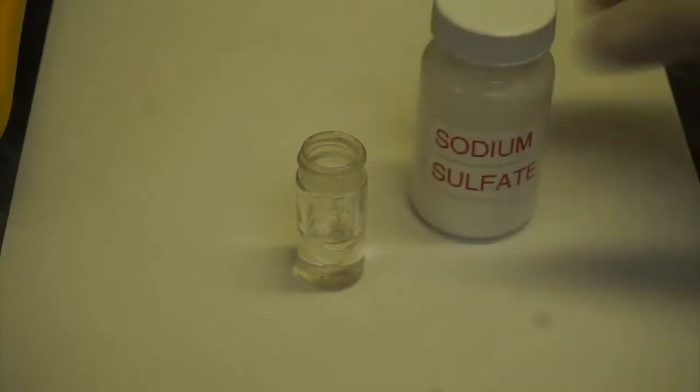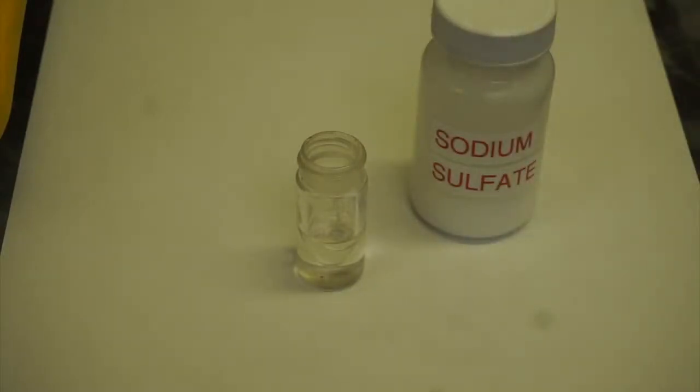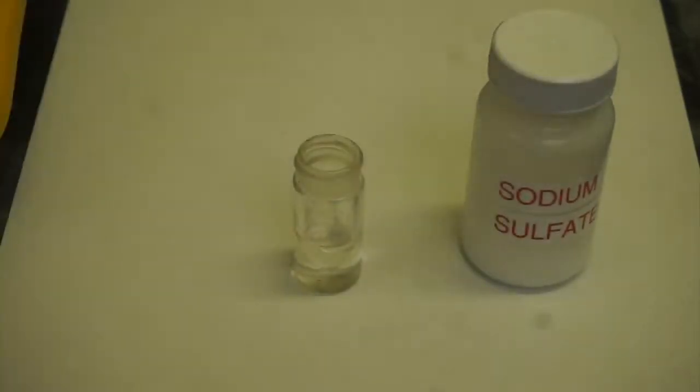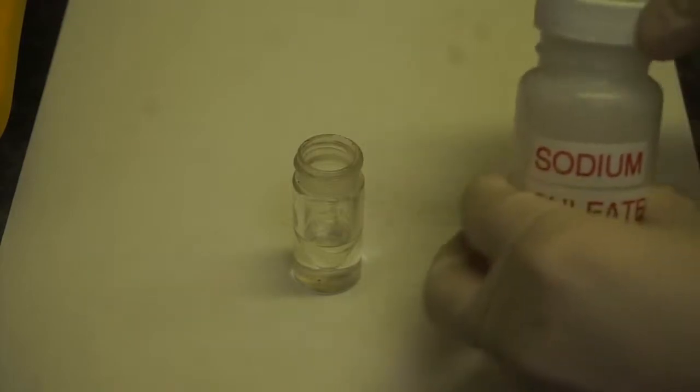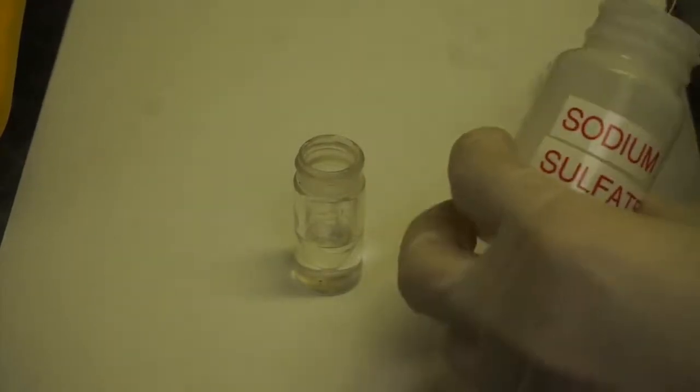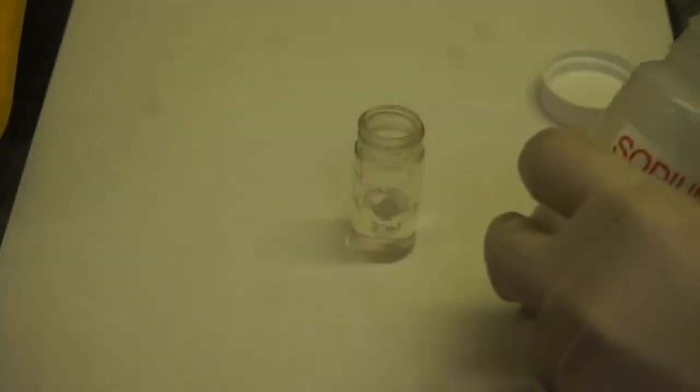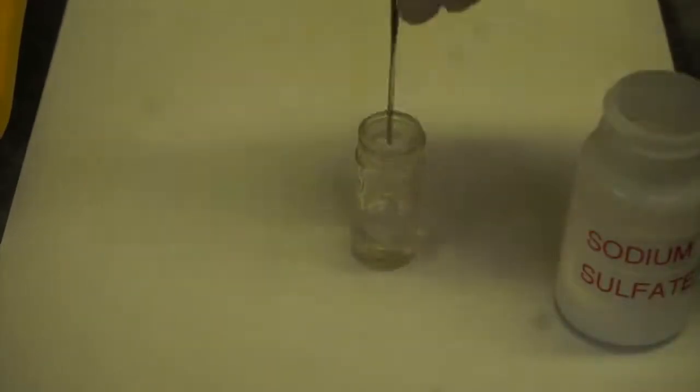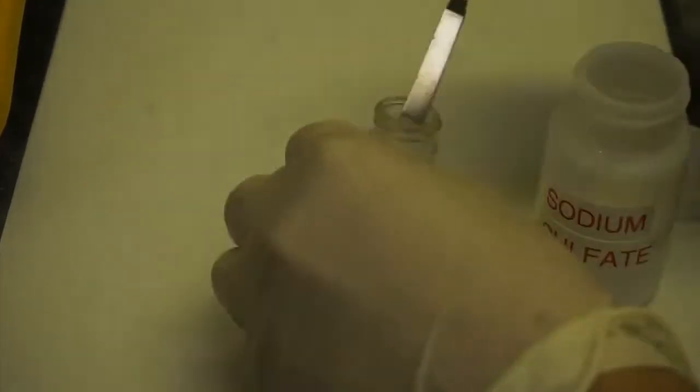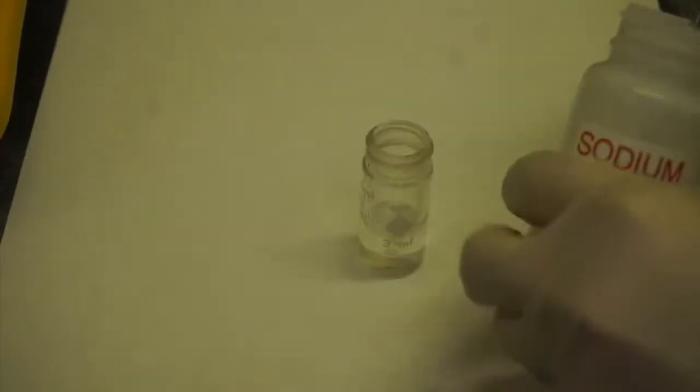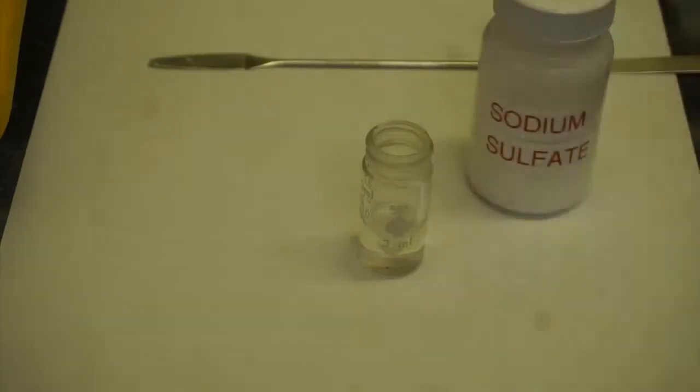First, water can be removed by addition of anhydrous sodium sulfate. So place enough anhydrous sodium sulfate into the conical vial. If you are not sure how much anhydrous sodium sulfate has to be added, please review the extraction experiment. After addition of the sodium sulfate, leave the solution for at least 5 minutes.